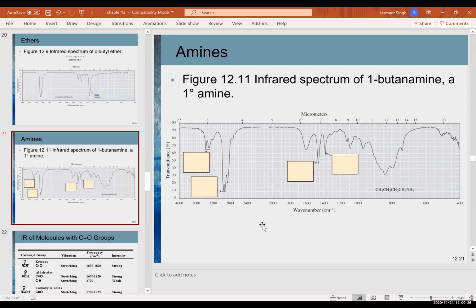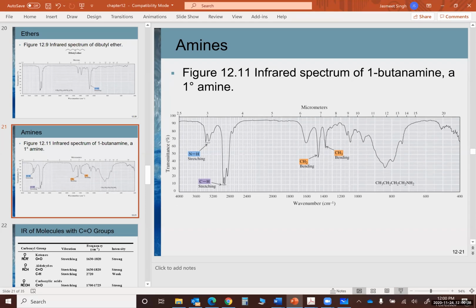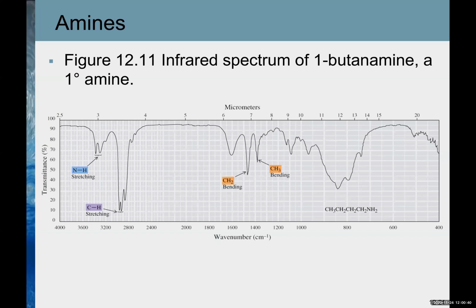Amines. So these two peaks we already know. This one is CH2, CH3, and these we already know.